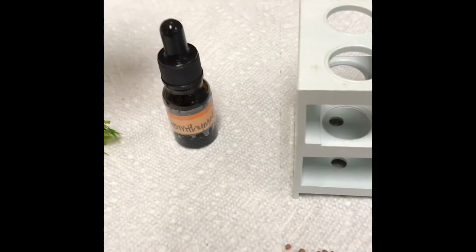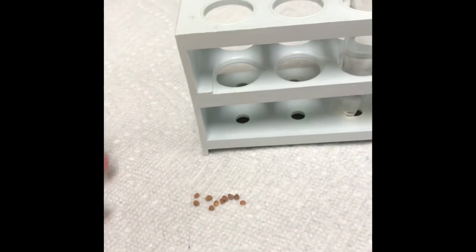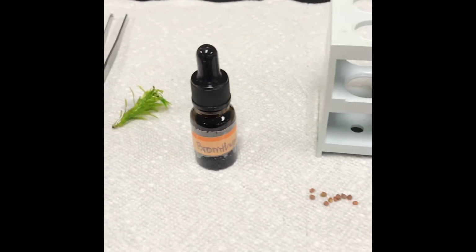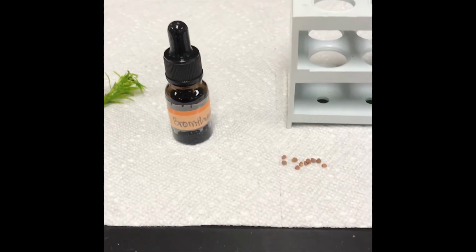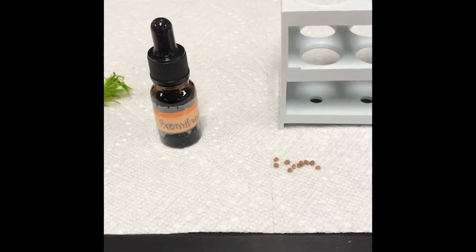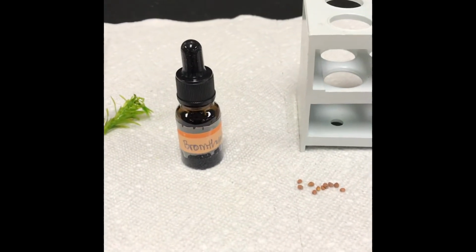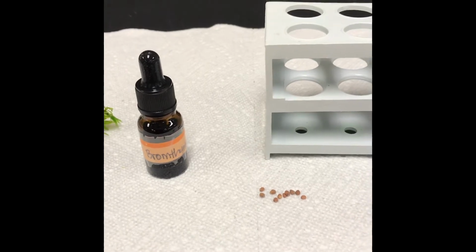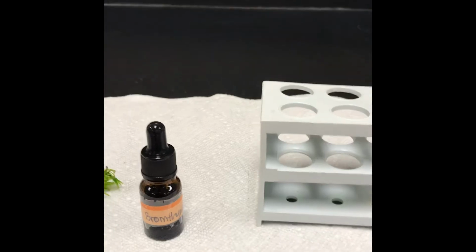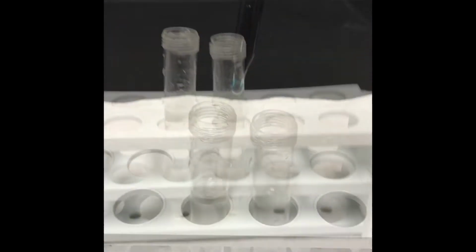So bromothymol blue is amazing because under normal circumstances, you'll see it comes in the bottle. When I take the lid off, it comes as a dark blue color. But when you have an acid in the environment, and an acid could be carbon dioxide because your breath, carbon dioxide is actually acidic, then it will turn it to a shade of green. And then if it's super acidic, it'll turn it to a shade of yellow. So I'm going to go ahead and add 4 drops of bromothymol blue to both of my test tubes.